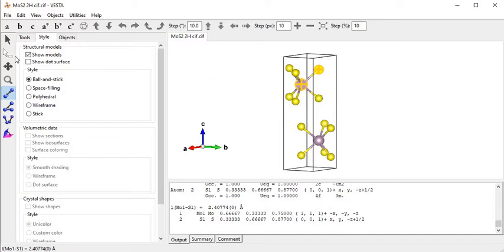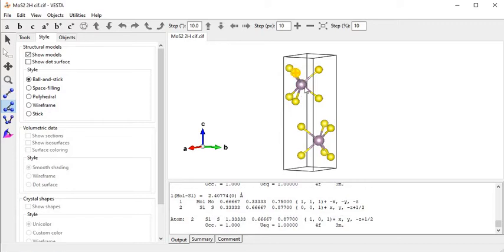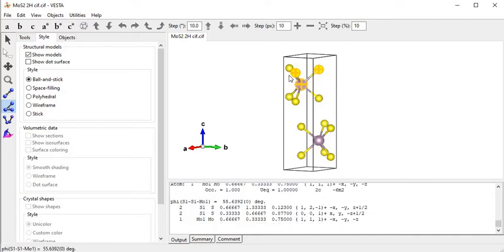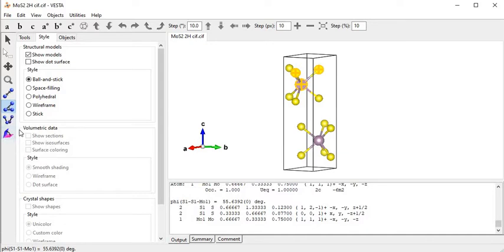This is the angle measurement - the angle between three atoms. The angle between these three atoms is around 55.6 degrees. This is the dihedral angle, and this is the interfacial angle. I don't know exactly what these two properties represent precisely.